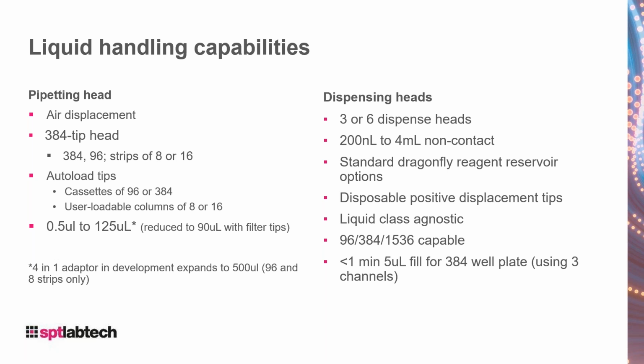These are disposable, but generally they would be used throughout a protocol or even multiple protocols during the day if you're not changing the reagent that you're using in that tip. So you can really cut down on plastic consumption. If you compare that to using pipette tips to do the same operation, you can really reduce the amount of plastic that you dispose of.